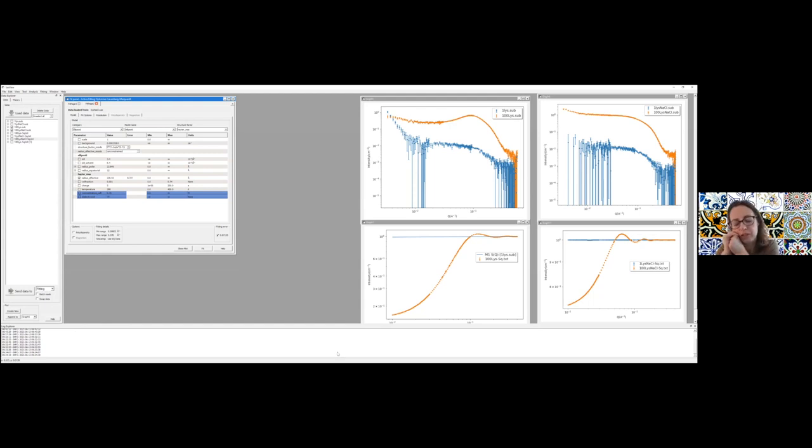Tell me what you're trying to do. So you have different samples? I just tried the same lysos and I tried to fit one sample and then keep the structure factor for one and add it to the next sample. Or at least use the first sample as an initial parameter for the next one. Yeah, as a reference. But apparently it didn't work. So I'm a little wondering why. It could be a version issue. Or it could be the way.